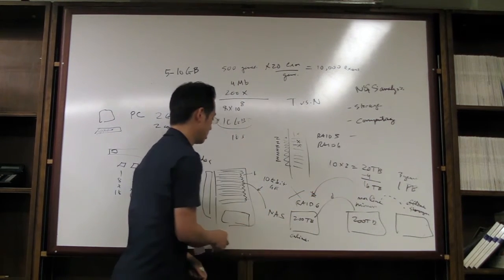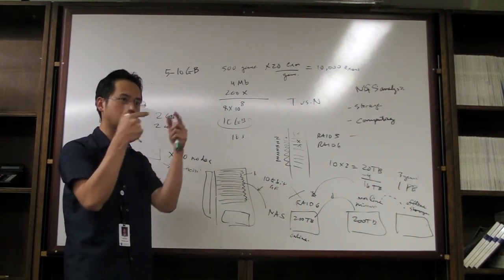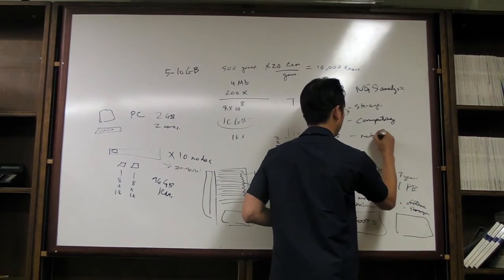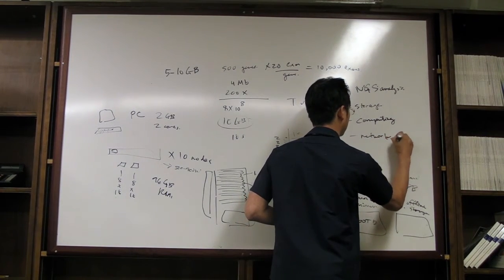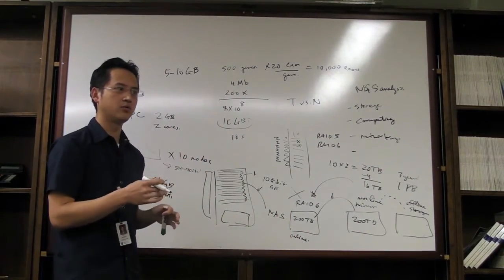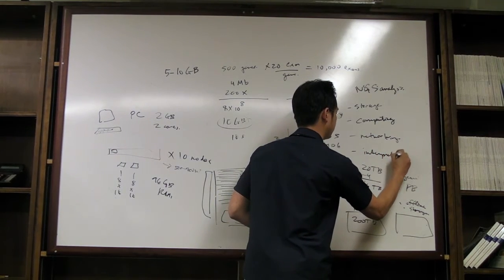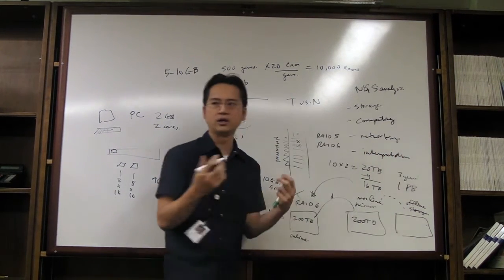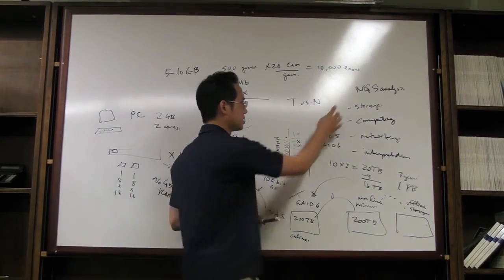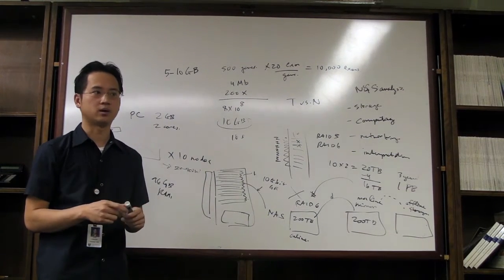used right now. Let's say your sequencer is in another building and you need to transfer the data; you have to connect all the pieces together with a fast enough connection. So networking is another complexity up here. And then finally, once you analyze the data, map it or whatever, the interpretation is the other complexity, right? You're going to get a lot of unknown calls, and how do you make sense of that, et cetera, et cetera. So these are the different challenges I see with the analysis pipeline.